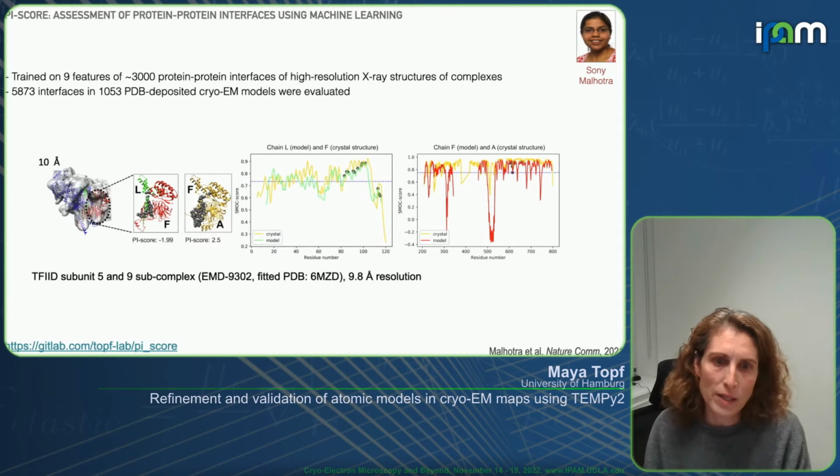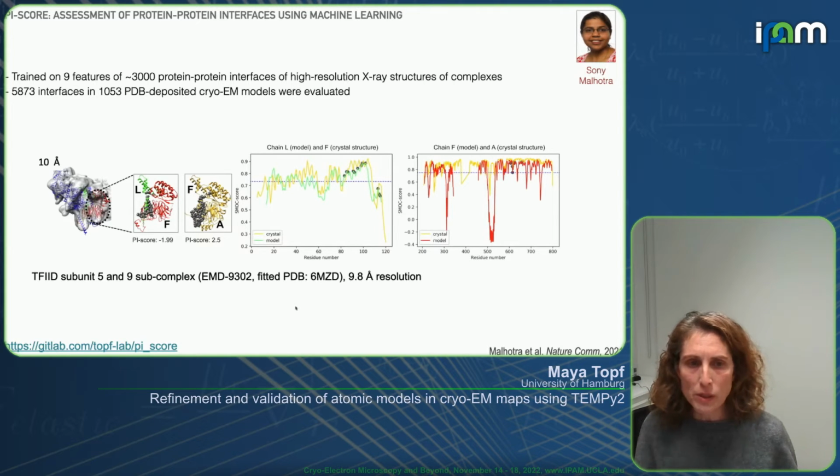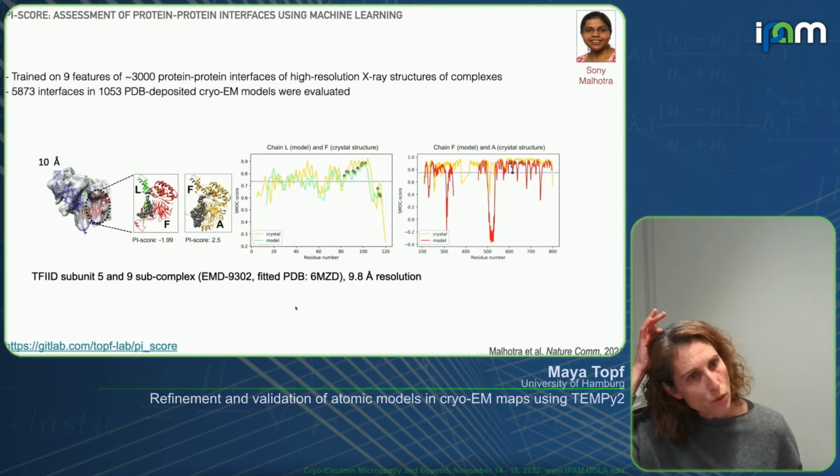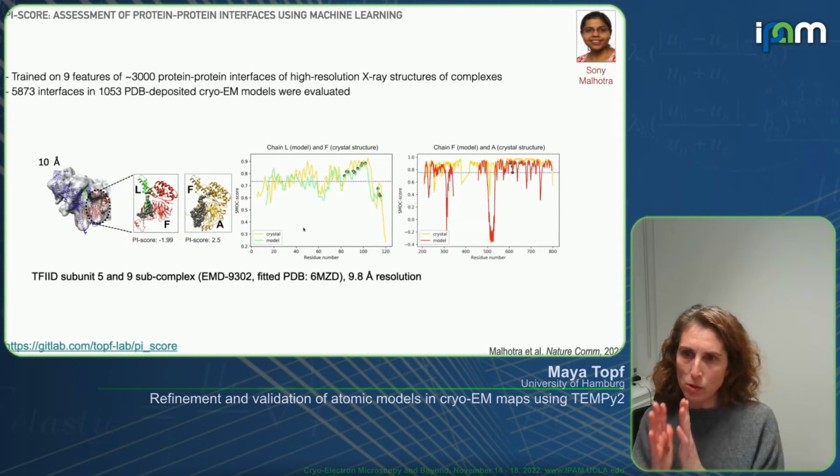In that paper we assessed all the cryo-EM models, looking at both scores and also the PI score. We call this the PI score.